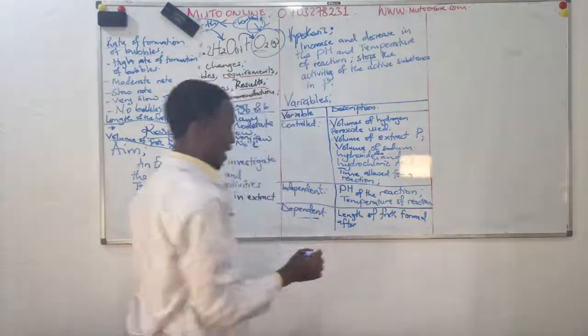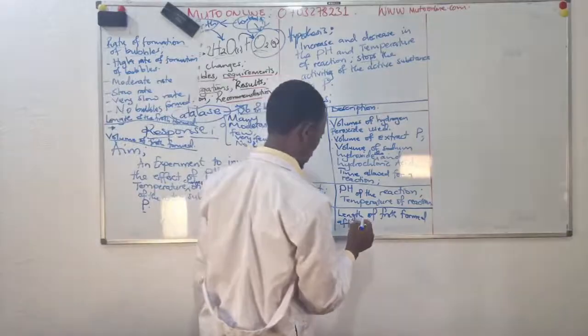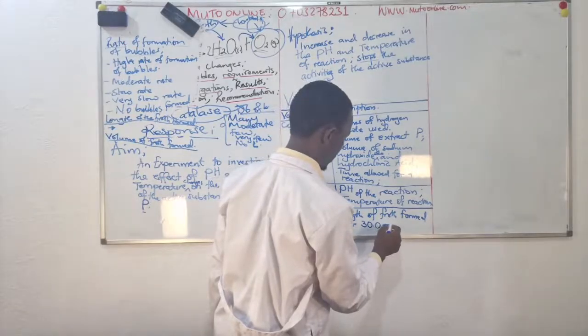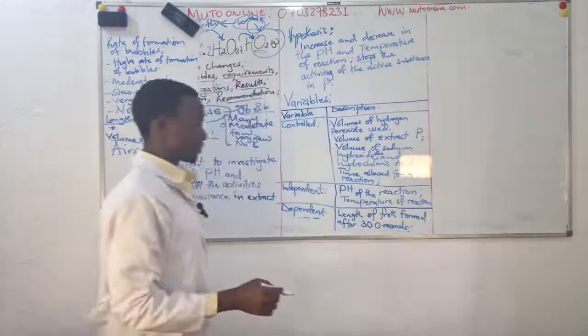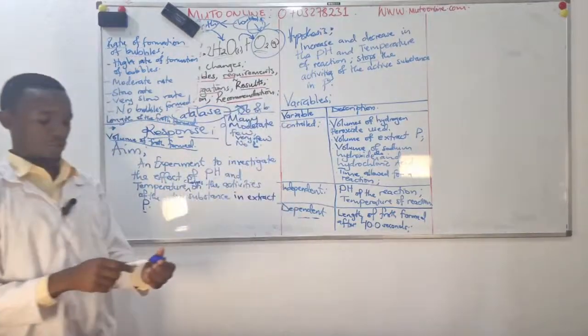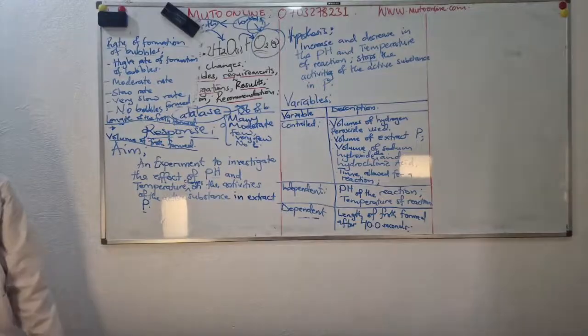I'll give 30 seconds. The 30 seconds may be few. Let me take 40 seconds. I'll record the length of the froth formed after 40 seconds.